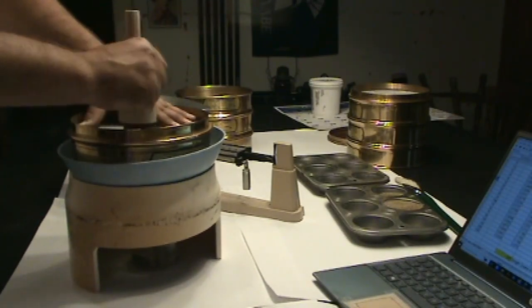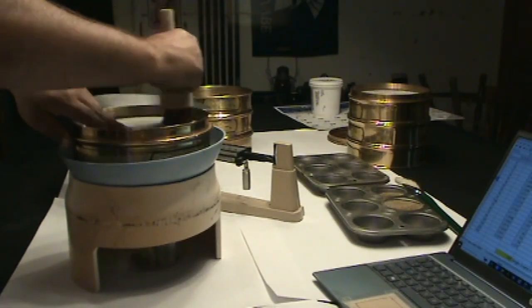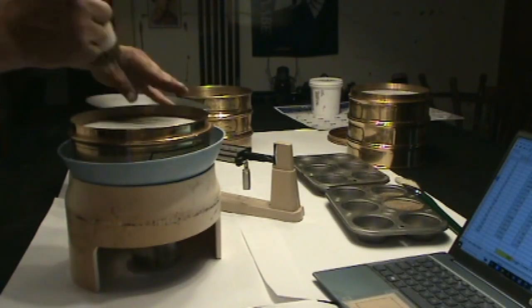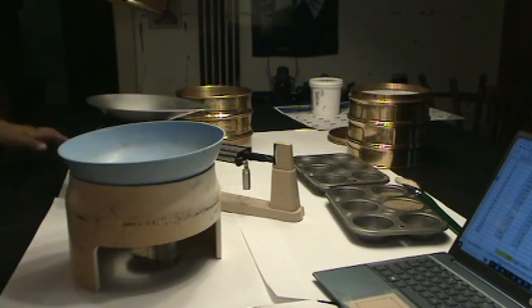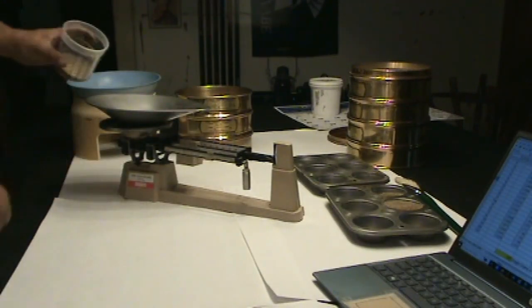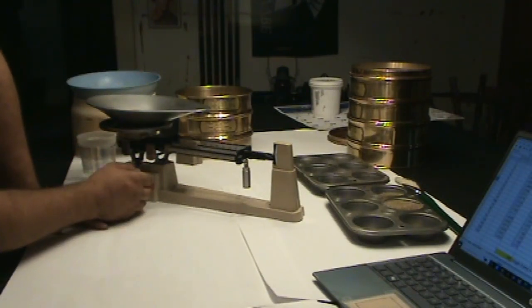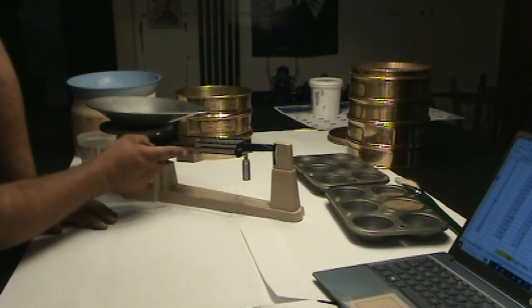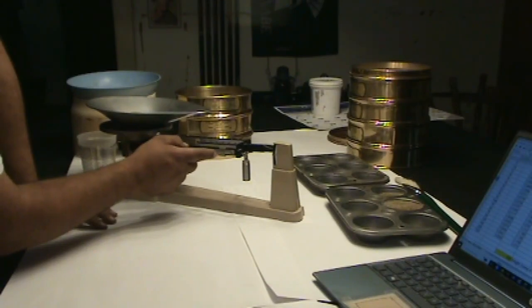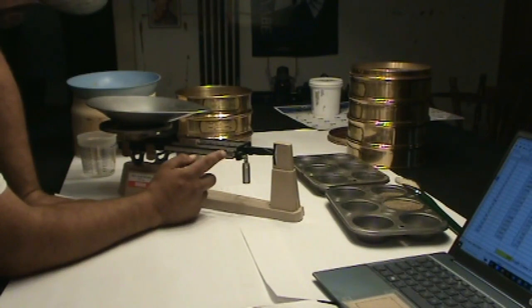The sand contents is washed and then kiln dried before placing in the super sacks. Upon delivery, each super sack is placed on a pallet and covered. This black pallet cover protects the super sacks from UV rays and its contents from moisture and contamination. Number 18, 109.9 grams, 33.3%.